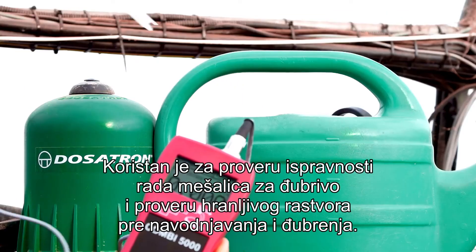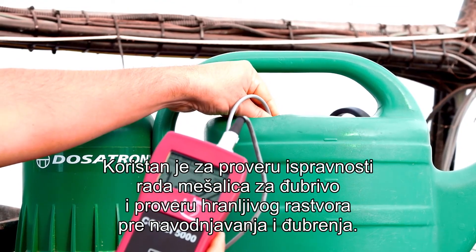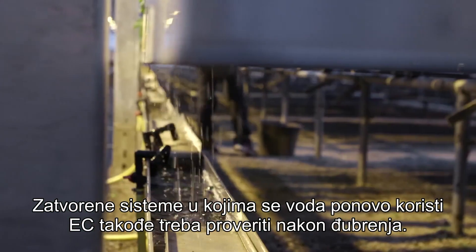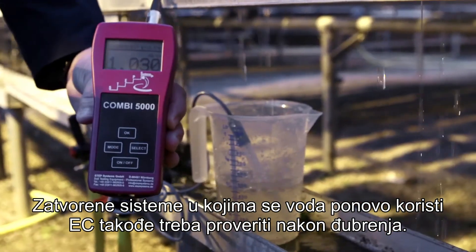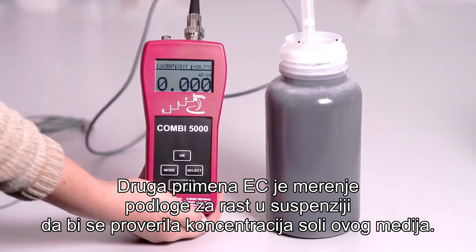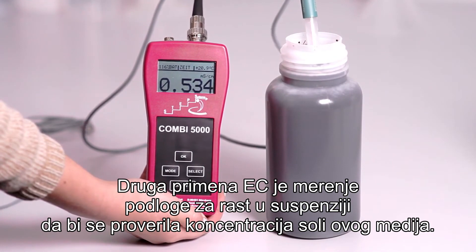The EC, or electric conductivity, measures the salt ions in water and in nutrient solutions. It is useful for inspecting the correct operation of fertilizer mixers and checking the nutrient solution before irrigation and fertilization. In closed systems where the water is reused, the EC should also be checked after fertilization. Another application of EC is the measurement of growing media in a suspension in order to check the salt concentration of this media.